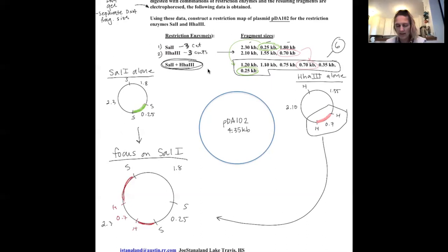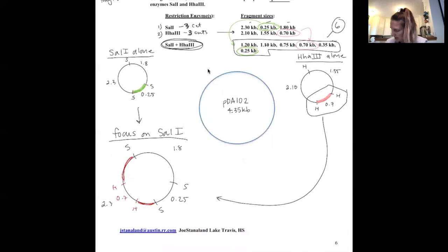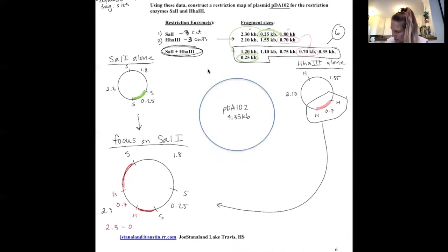And I can look up here and say, okay, 1.6 minus, let's say 1.5, that doesn't give us anything. So again, what I'm doing here is taking 2.3 minus 0.7 to give us 1.6. And then I'm subtracting any of the known base pairs up here to see. So this time I'll do minus 1.2. Doesn't give us anything we want.